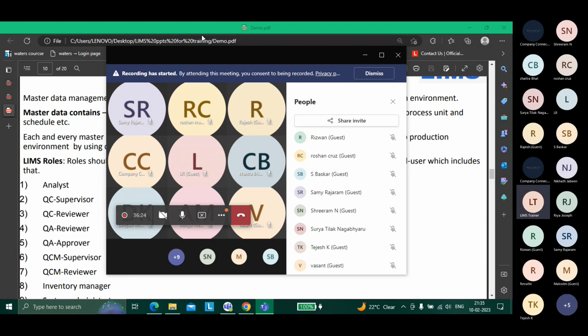Try to understand the difference, right? From the front end, you see that someone who is an admin is able to do everything. He or she is able to reject, approve, create workflows, change the backend code, and change some rules. But when you log in as a simple analyst, you are only able to enter values for samples. You are not able to see all the workflows, all the modules, or all the ribbons, but that does not mean others won't be able to see them. Got it, right? We'll discuss in detail when we go to the users table.